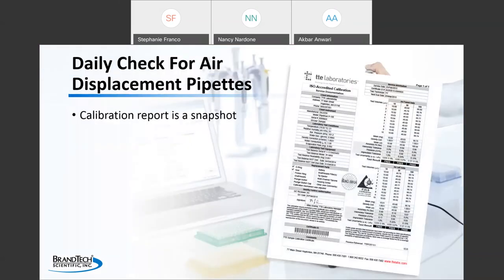Once a calibration is complete and a report is generated, it's important to note that this is really a snapshot of how the instrument is performing at that moment in time. If the instrument is handled and maintained properly, it should continue to perform as expected within specifications, no problem. However, we all know that unexpected things happen.